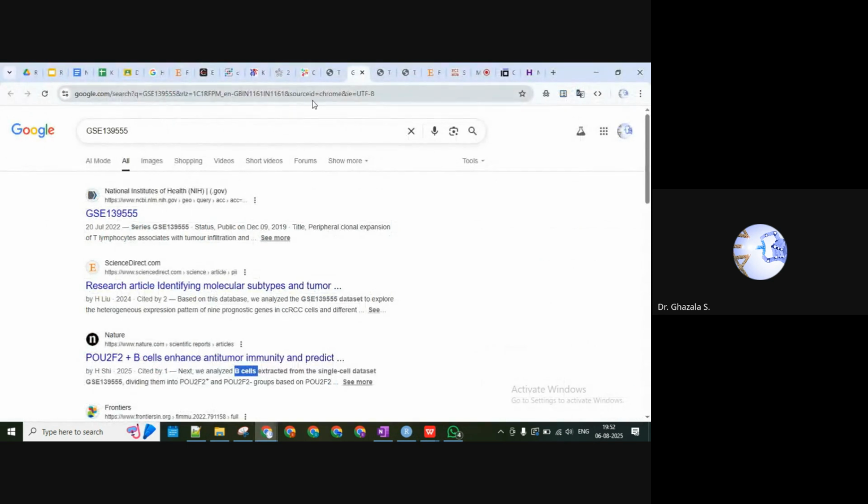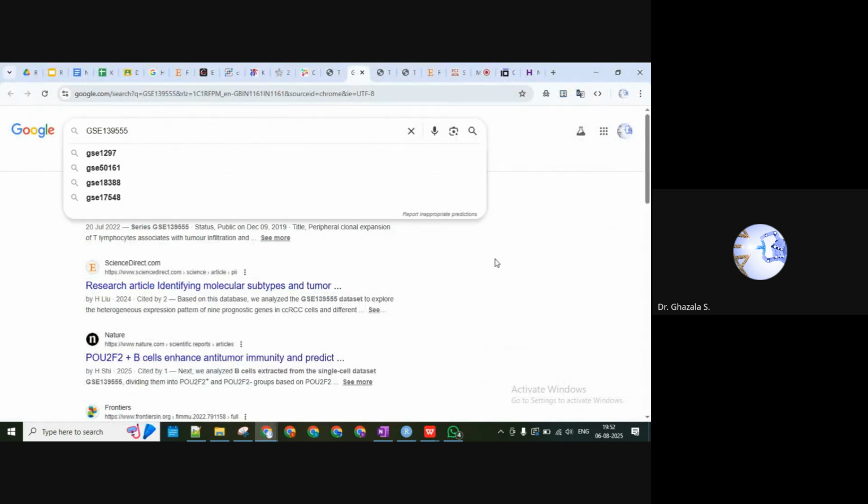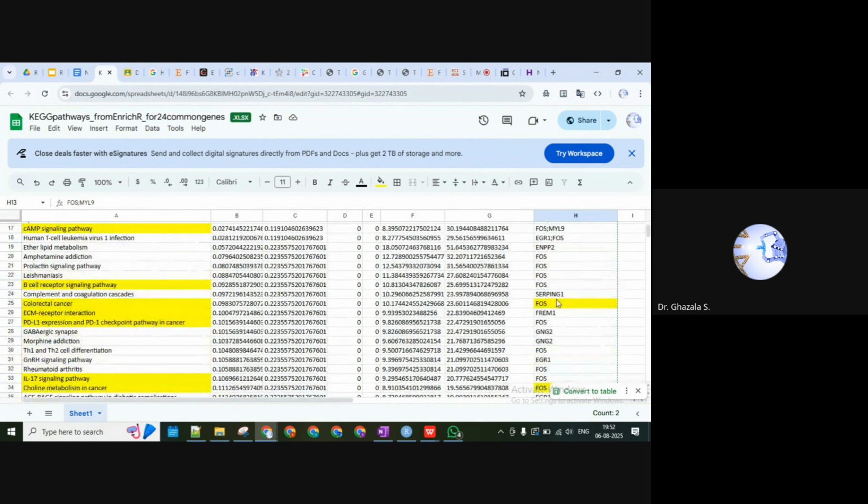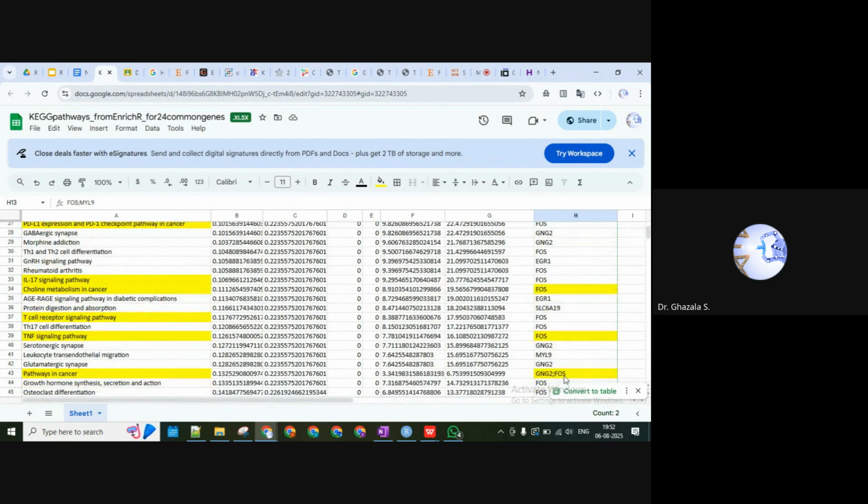Regarding the tumor microenvironment, you need to do the task specifically based on the genes which are novel and not novel. First filter your important genes which are involved in these pathways. With these genes, proceed to check which are novel genes and which are not.